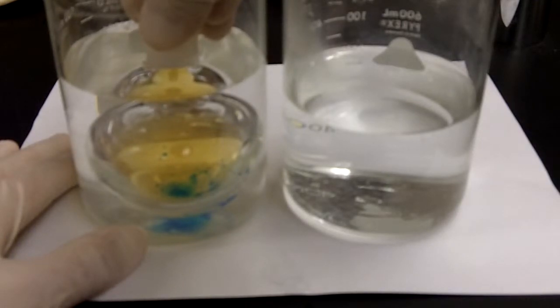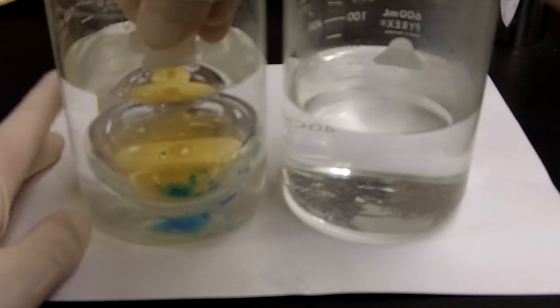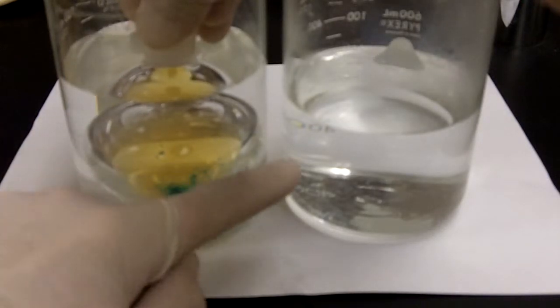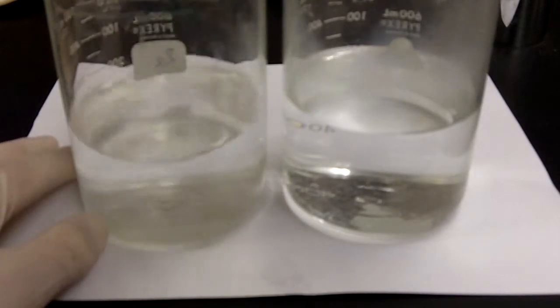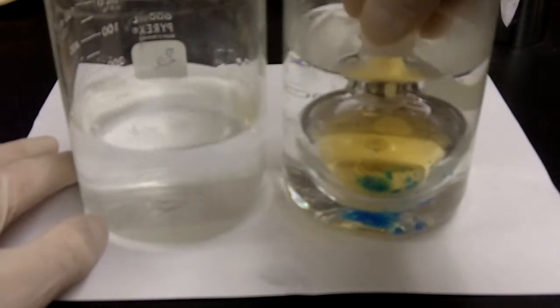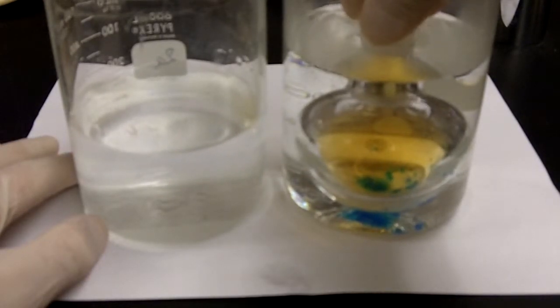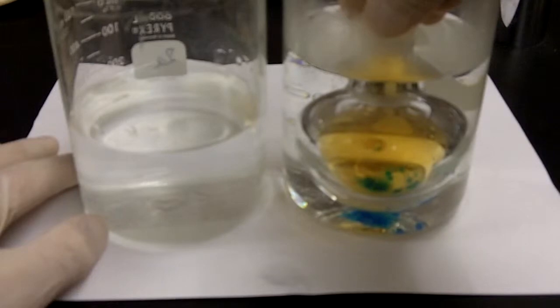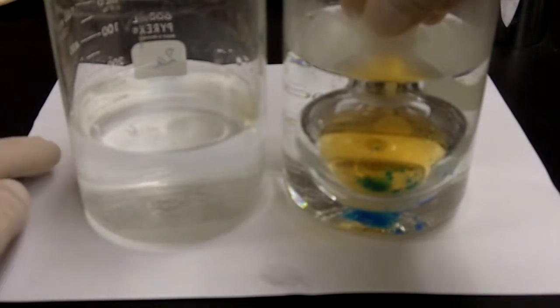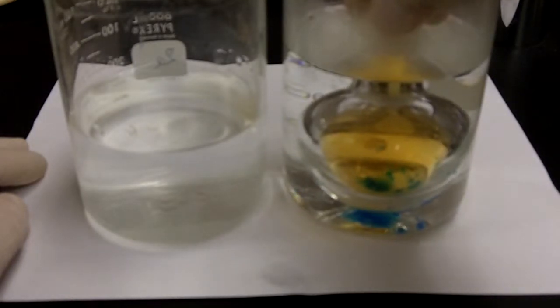And with the white paper background, you want to see if you can notice a change in the intensity of the brown color. It's going to be made much more obvious when we go from this beaker of cold water over to the beaker of hot water. So the thing you're looking for is a change in color, darker in one, lighter in the other, and making the determination as to which one results in the darker color and which one results in the lighter color.